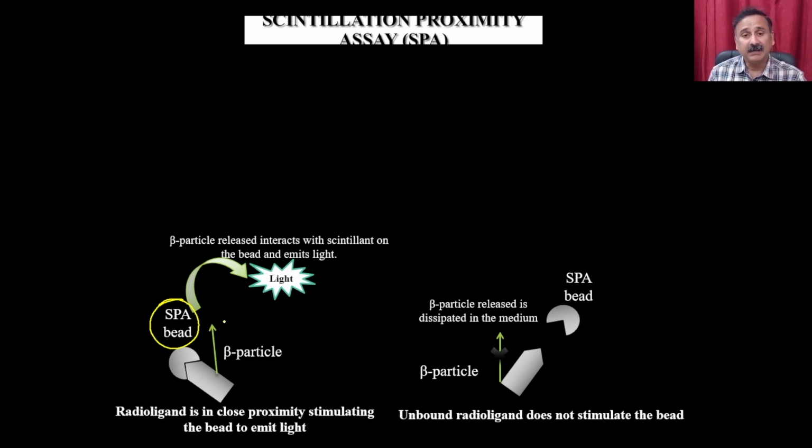Okay. In an ideal setting, when you want to do radioactive measurements, you take the radioactive nuclei and put them into the scintillation cocktail, and then you put the vial into the beta counters or the gamma counters, depending on the type of radioactive nuclei you have used.